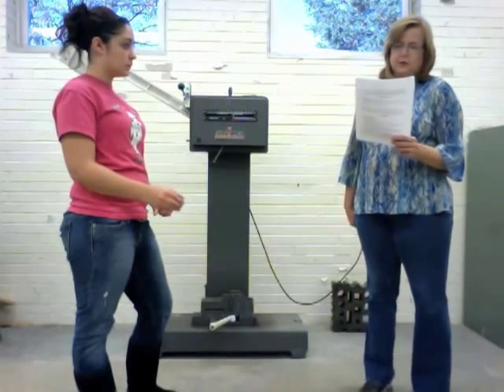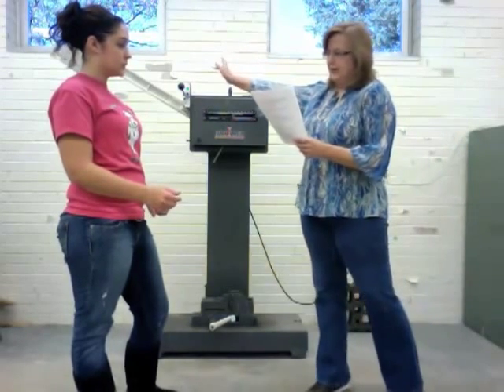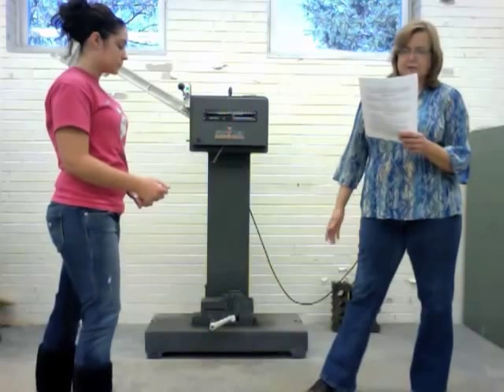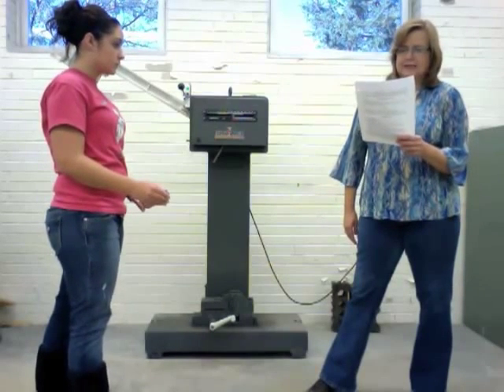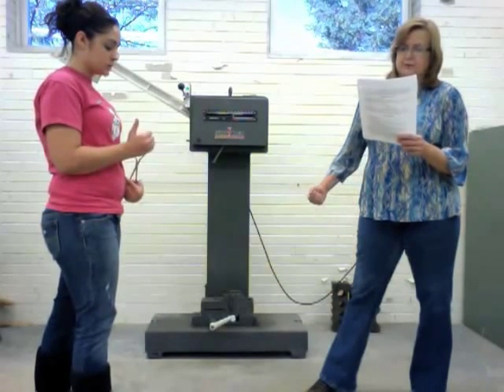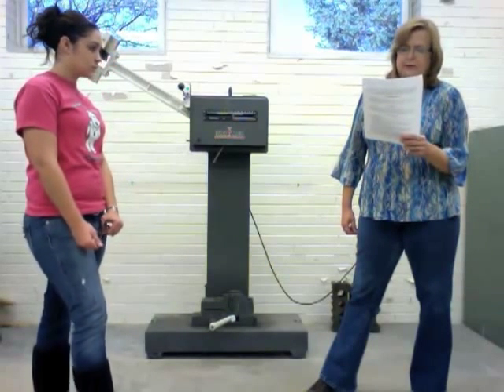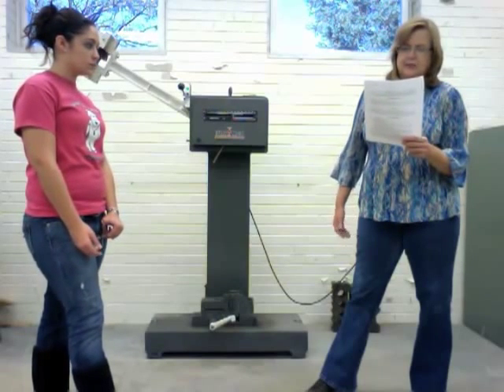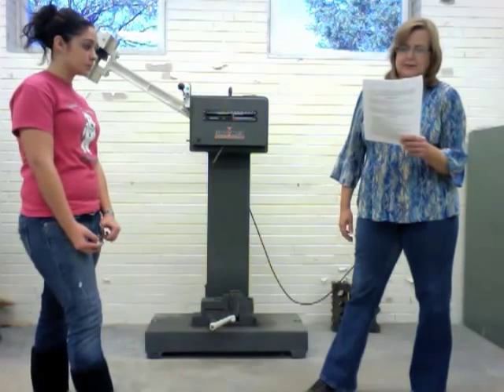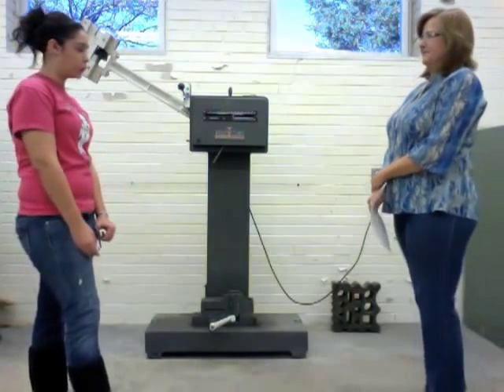Impact energy is the measure of work done to fracture a test sample. An arm is held at a specific height, constant potential energy, and released. A specimen is usually notched. When the striker impacts the test sample, the specimen will absorb the energy at the notch, and it becomes deformed. It continues to absorb energy and hardens at the notch. The sample breaks once it cannot absorb any more energy. Strikers come in different sizes to establish the impact energy, starting with the smaller strikers and increasing the size until the material breaks. Today we'll be working in fairly stable conditions, like average room temperature.